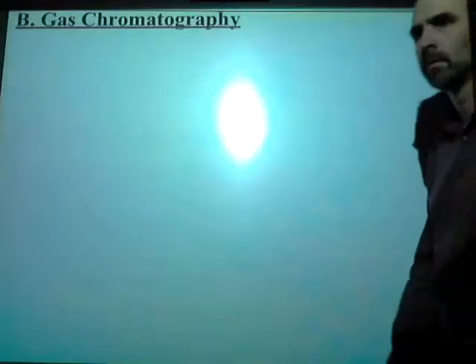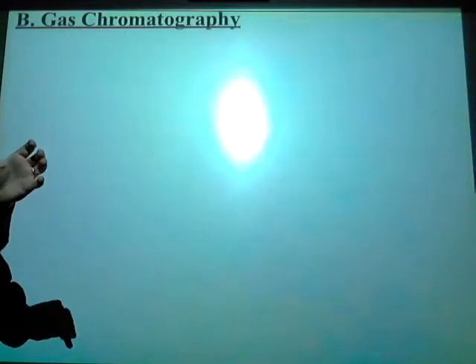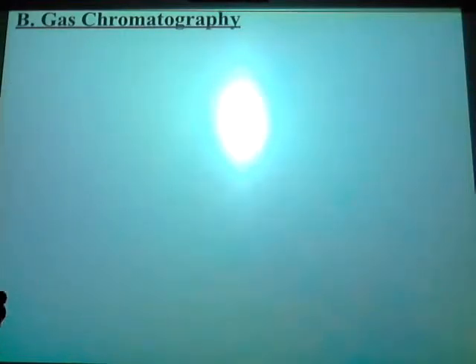All right, gas chromatography. Turn the light off, please. Okay. Pay attention. This is the first one, although not great quality, actually is a better description of what's going on in gas chromatography. Here, your mobile phase is not a liquid. It's a gas, as implied by there. And the solid phase is not paper. It's a column, like a tube, wrapped in a coil inside a machine.